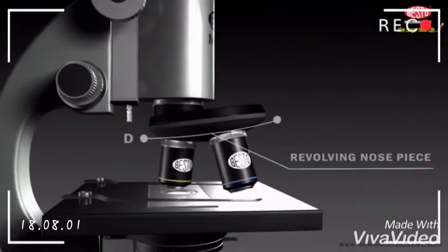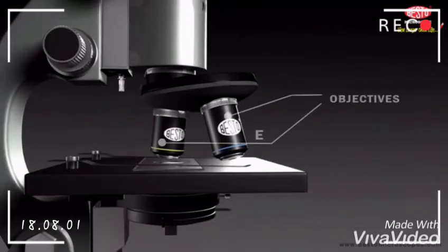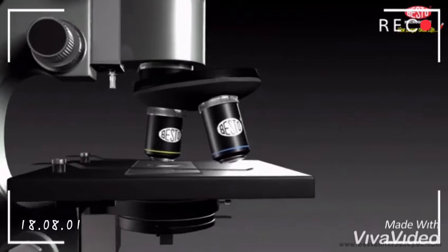The revolving nose piece holds the objectives and allows you to change objectives while looking at a slide or sample. The objectives are the parts at the bottom of the body tube closest to the sample you are examining. Each objective has a lens and a tube-like holder. The longer objectives are the stronger lenses, the high power lenses. The shorter objectives are the weaker lenses, the low power lenses. Some microscopes only have one or two objectives.